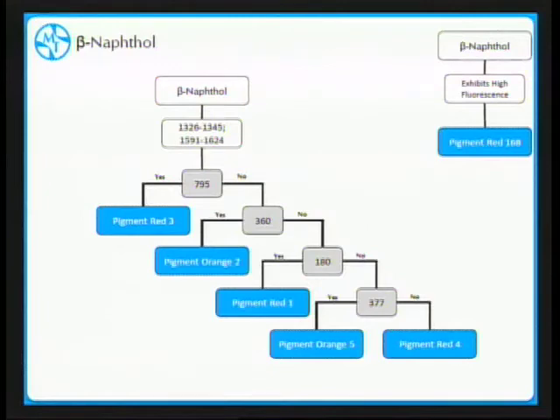You can get to a specific peak. The nice thing about this is that when you're looking at a paint sample, a lot of times you don't have all the peaks that you would have in a nice reference spectrum. Not even a lot of times, all the times. Generally, you're limited to just a couple of peaks. The nice thing about this table is that it's not just for classification, but to know how far you can take an identification. Can you take it just to a group, such as beta-naphthol, or can you start to eliminate some of the pigments? This whole scheme, which can be expanded to include more pigments in the future, allows you to know exactly how far you can classify your pigment.